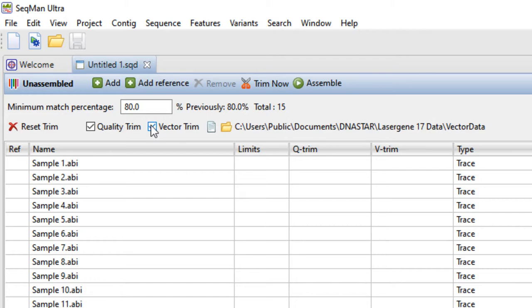To instead look for custom vectors, navigate to the file or folder of vector sequences using the buttons to the right of Vector Trim.